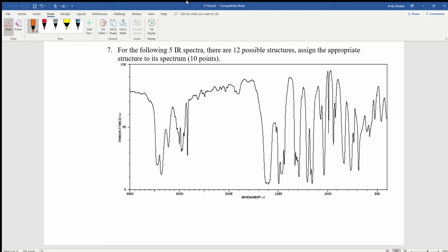So for the first spectrum, the first thing we see is this group of 2 peaks right here. Anytime we see that group of 2 peaks together like that, that's a sign that we're dealing with a primary amine, an NH2 group. As for whether this molecule has any carbonyls or not, it's not completely clear at the moment because we have something here that's in the low 1600s. So the initial instinct would be to say that no, there's probably not a carbonyl in this molecule.